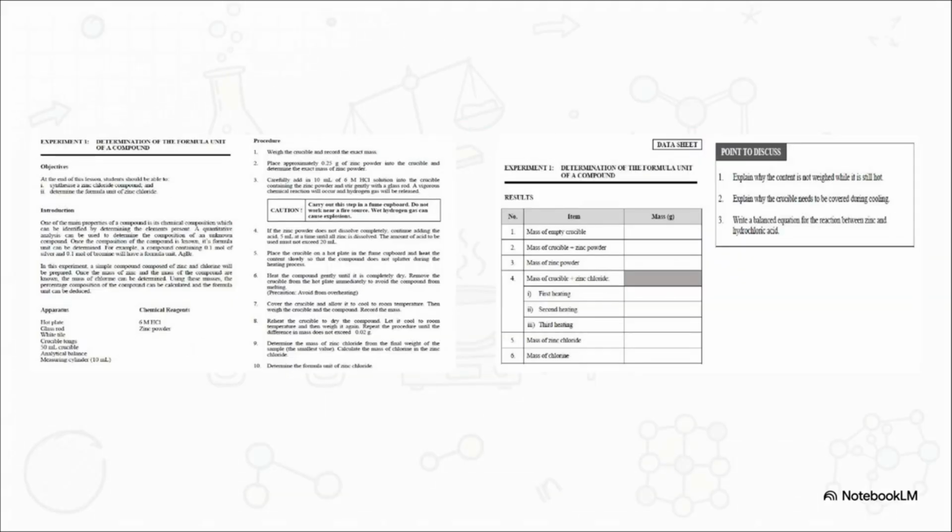And this brilliantly illustrates the entire purpose of a lab experiment. It's like a giant puzzle coming together. You've got the physical steps from the procedure manual, the pouring, the heating, the weighing. Then you have the data sheet. Every single physical action you took directly populates the ultimate calculation rows. The physical world translates perfectly into cold, hard mathematical data.